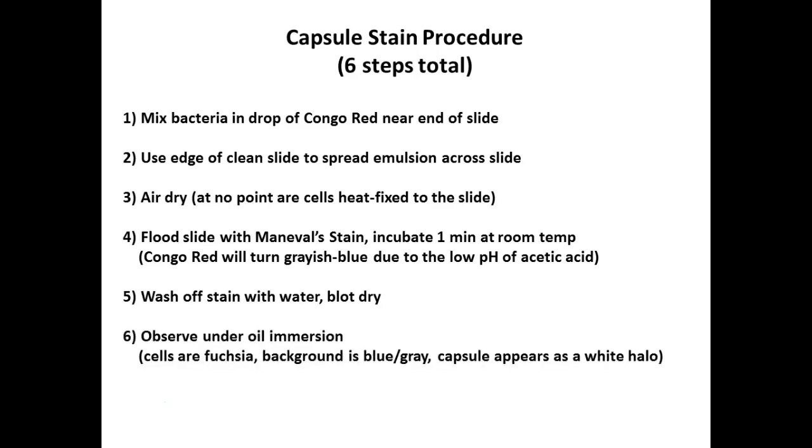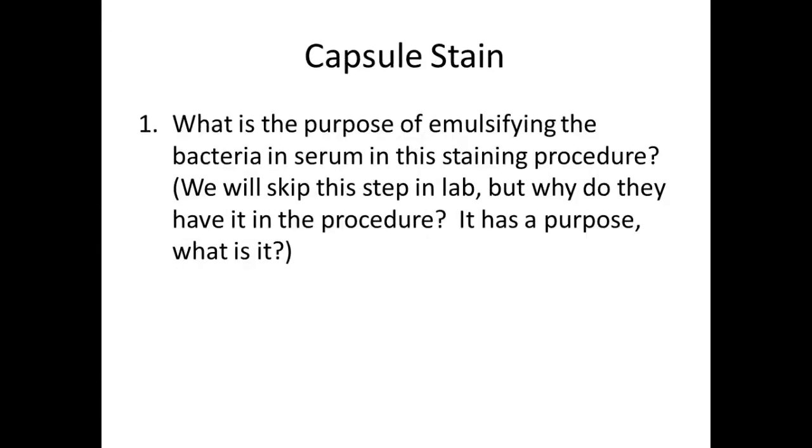And of course, always use oil immersion. Remember, we're doing a negative stain like last time, but also kind of a simple stain where we flood the slide. Because of that, we're going to be able to visualize a capsule, because of how those two different stains work, how a negative stain works versus simple staining with a basic dye.